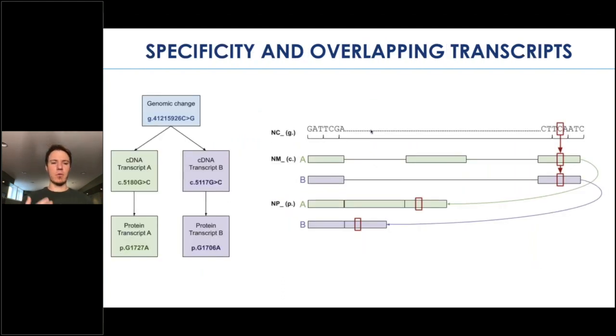So going back to the first slide that I showed here, keeping all of these things in mind, keeping in mind the fact that you have very specific ways of searching and describing variants as genomic coordinates that can map to multiple transcripts. You also have the nucleotide-specific nomenclatures for variants compared to the codon-specific variant nomenclatures. And I've also shown the benefits of using one versus the other and how those might change and become less clear, particularly in the non-coding regions. But everything that I've mentioned also applies to the coding regions as well.